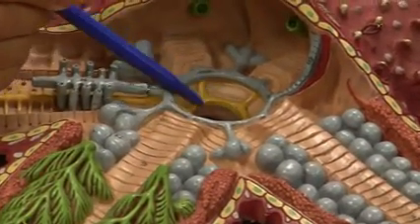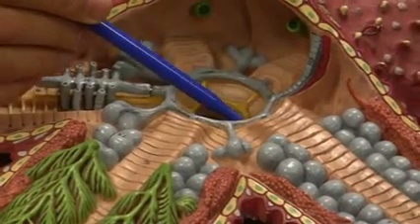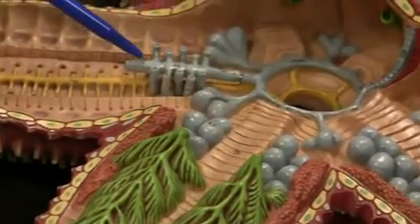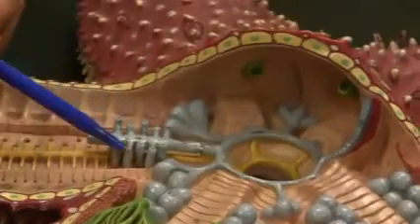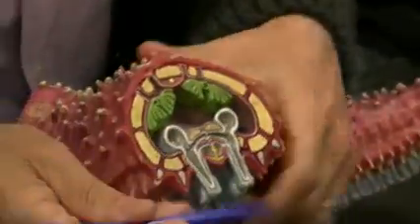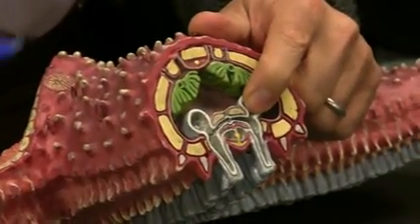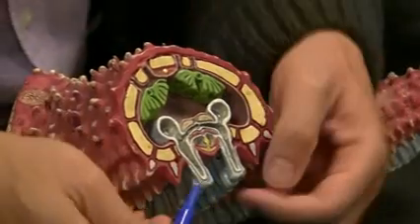These are all nerve. All of the yellow you see in these animals is nerve. Nerve ring, nerve cord. Okay, then it's connected to the radial nerve, right here on the cross section of the animal. You will see it. Okay, can you see this? So you have the ampulla. You already saw it up here. You remember that? So, ampulla.